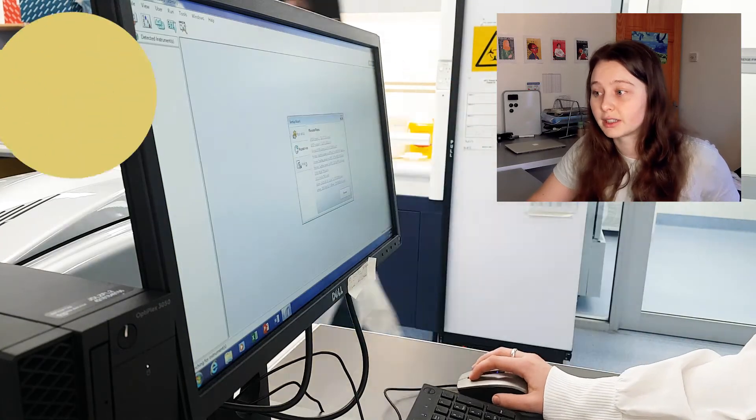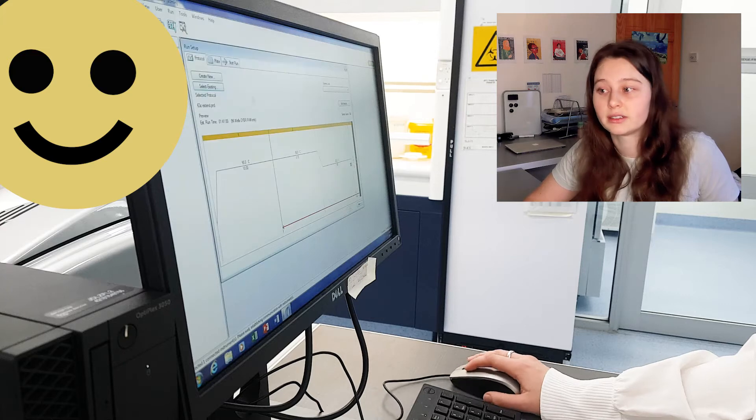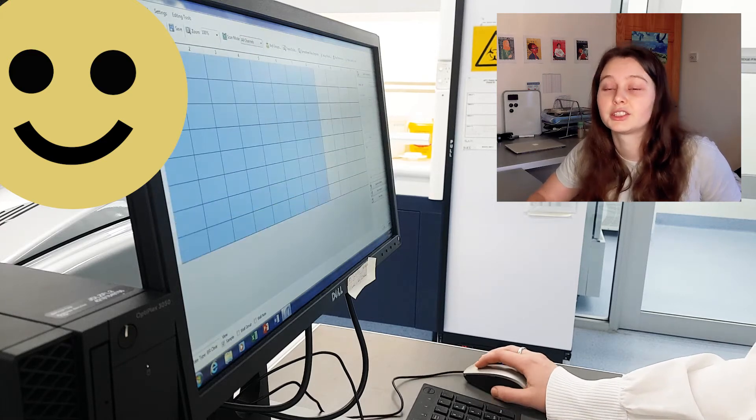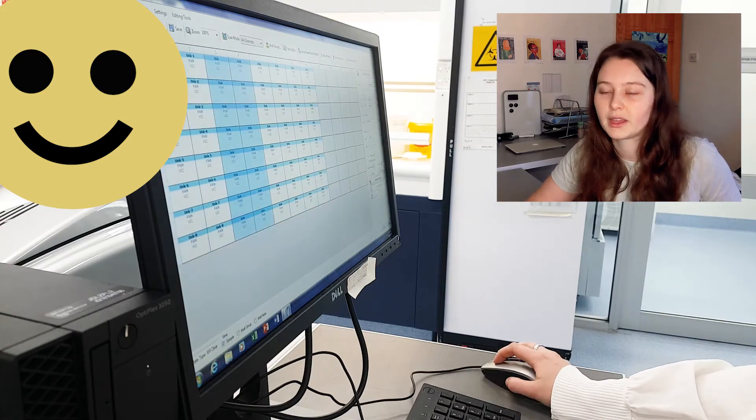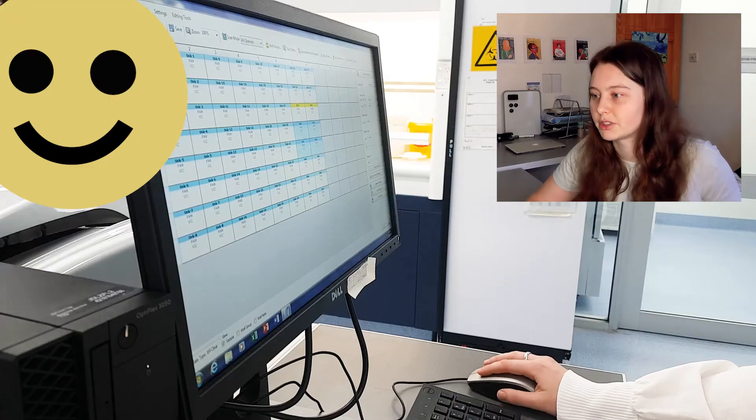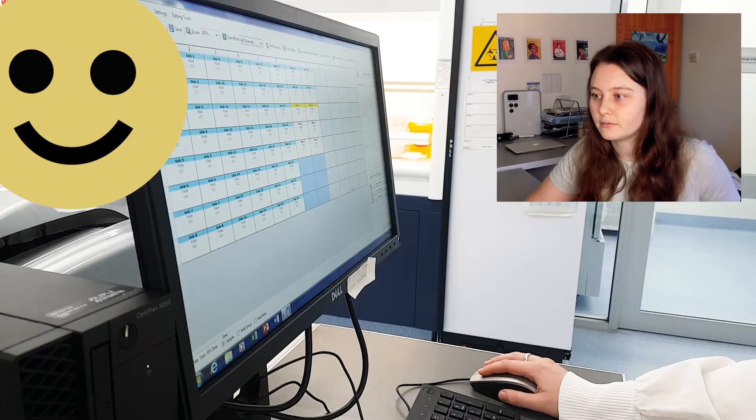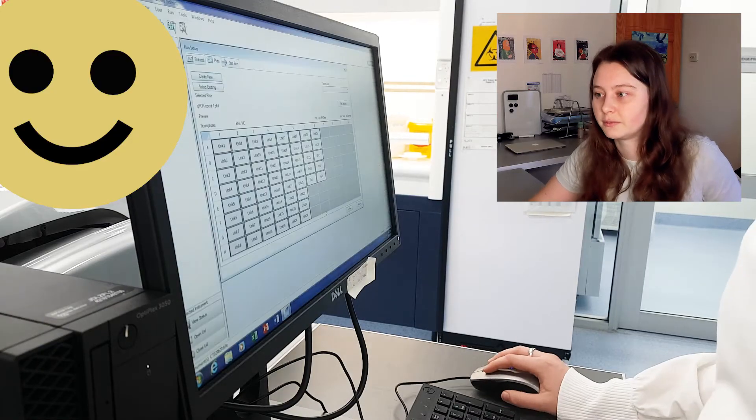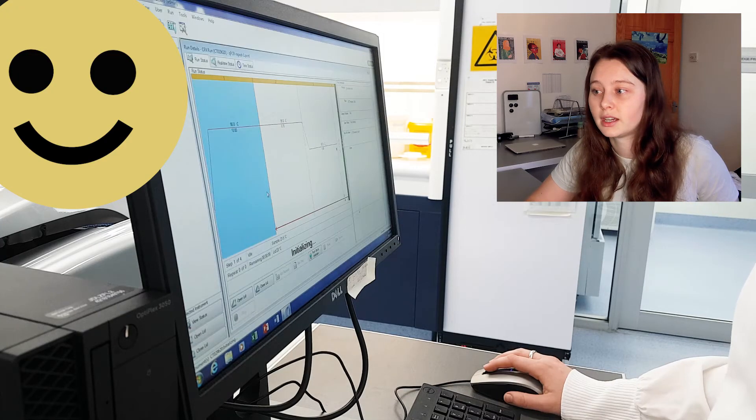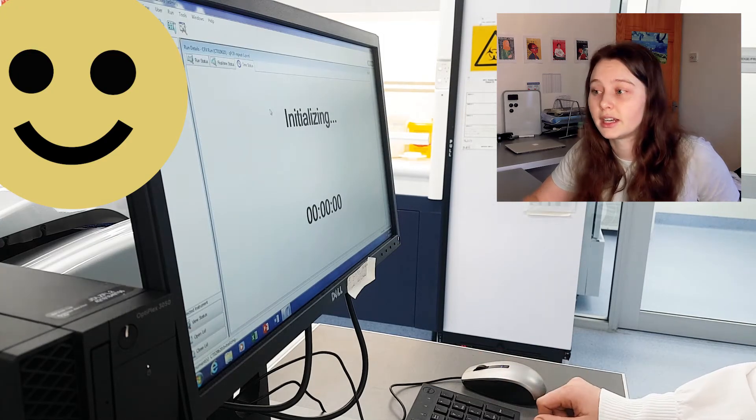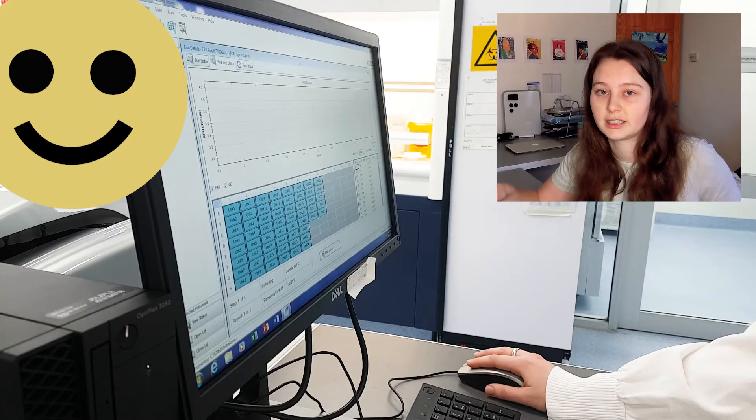So here I'm setting my run conditions, but that doesn't take long because I'm doing the exact same qPCR just on different samples every day. So I've already pre-set it, I'm just loading previous templates here. What does change is exactly what samples you've put in, so I find it's worth it to spend some time saying what those samples are now, especially if you're doing multiple qPCRs a day.